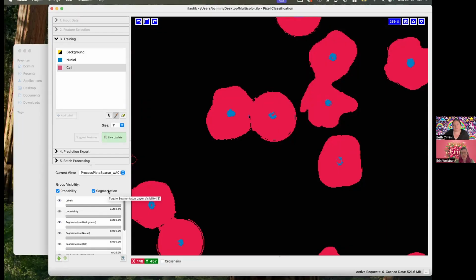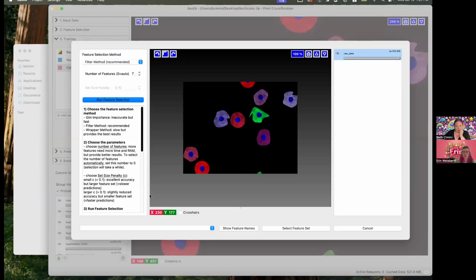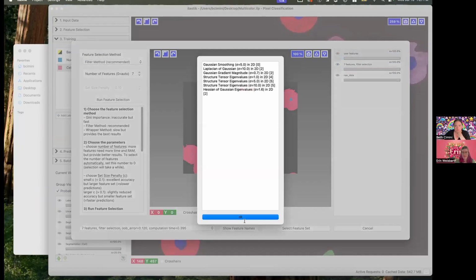So what you're saying is it's probably actually just ignoring the color now that you've added so many of those other pixels, and focusing on what is similar between the objects, which we can check. Yeah, so these are now definitely getting into some very textury features. It's kind of ignoring the colors.